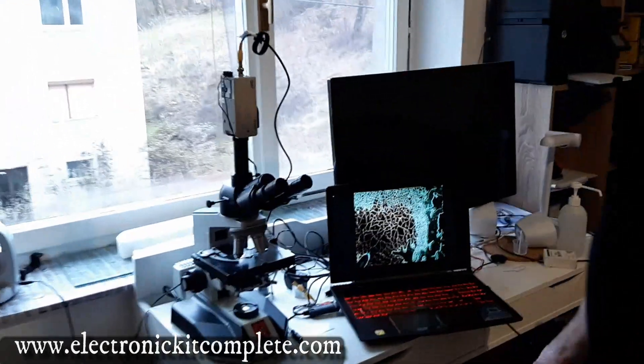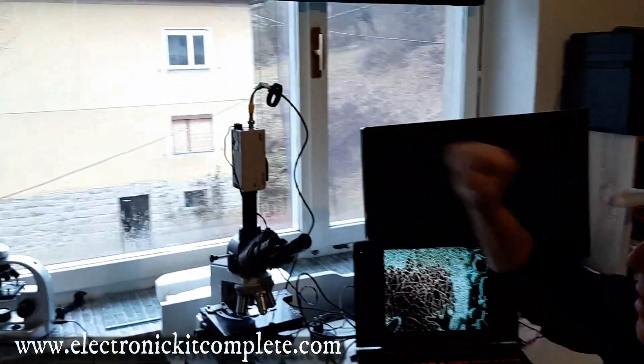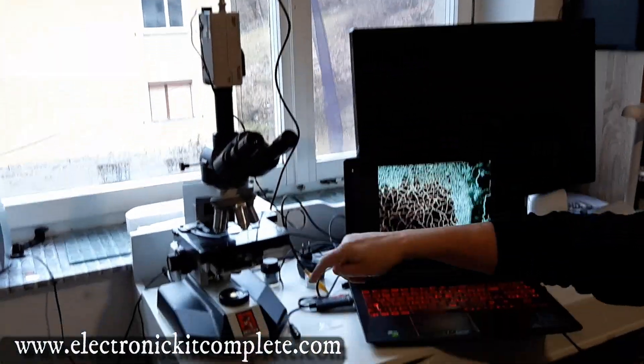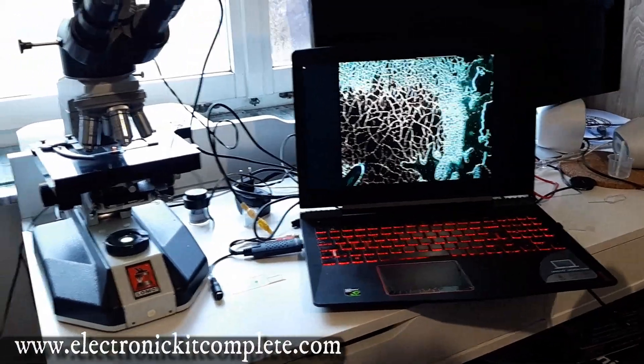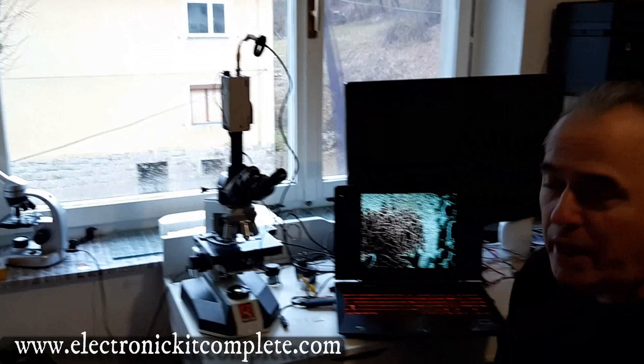I bought this beast of a microscope circa 10 years ago. The camera is a little bit old — I ordered a new one. Here you can see the dark field condenser, so-called condenser. It's old blood from yesterday, but you can get the picture.